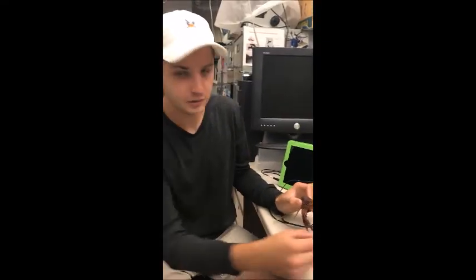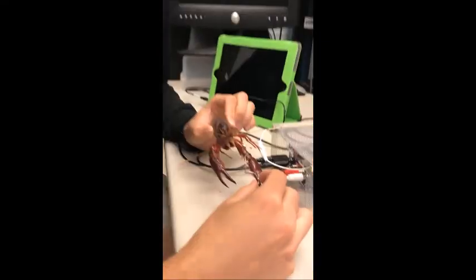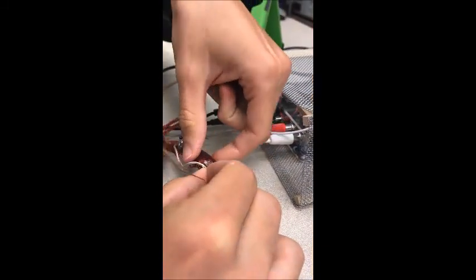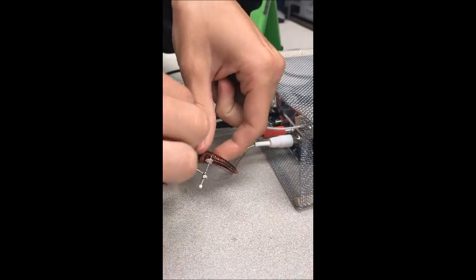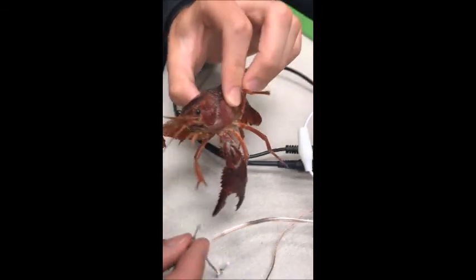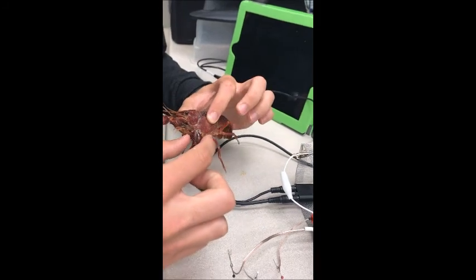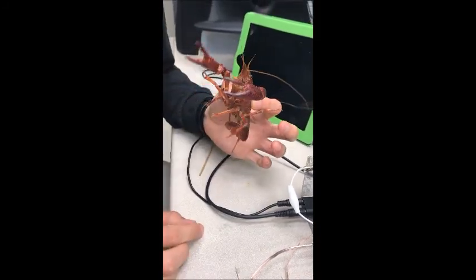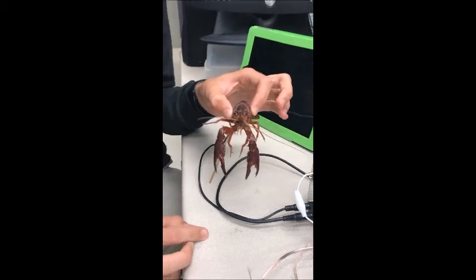You can easily remove these pins by pulling out, and once you pull these out, the crayfish can be used for other experiments and is not harmed. Here, it's still going. After you pull these legs out, you need to be careful not to pull too hard on the claw though, because it could autotomize, and then you would have a legless crayfish.